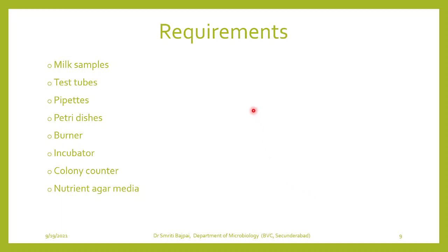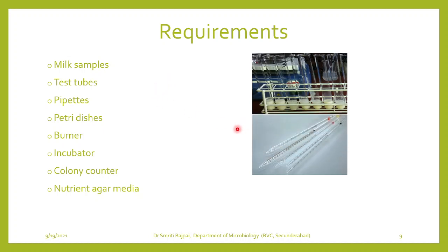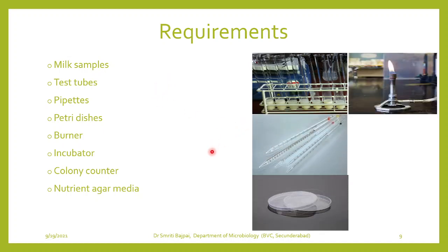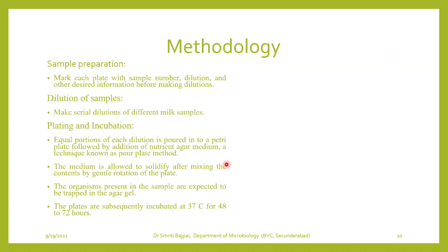Okay, so the requirements for this experiment, SPC, are the milk sample, test tubes, pipette, petri dishes, burner, incubator, colony counter, and nutrient agar media. So after that we will go for the methodology for this experiment.